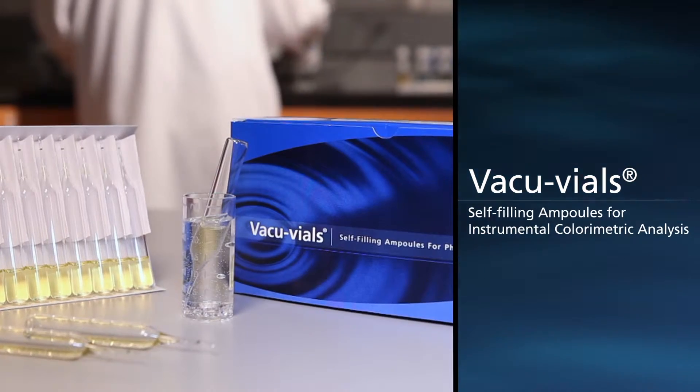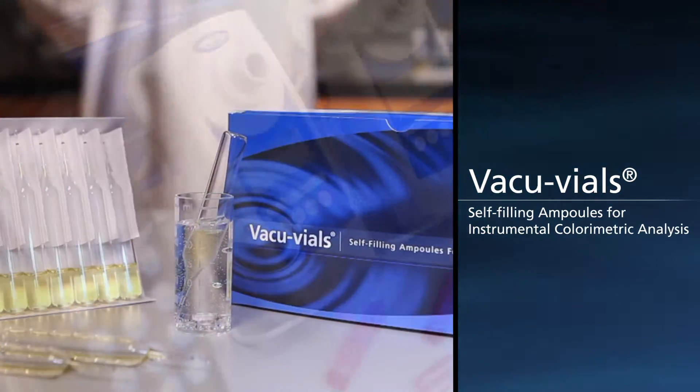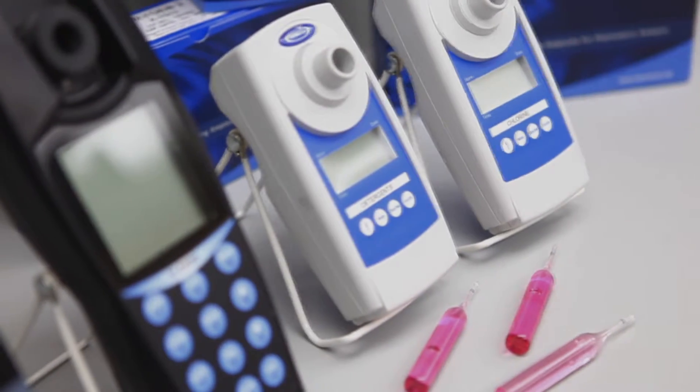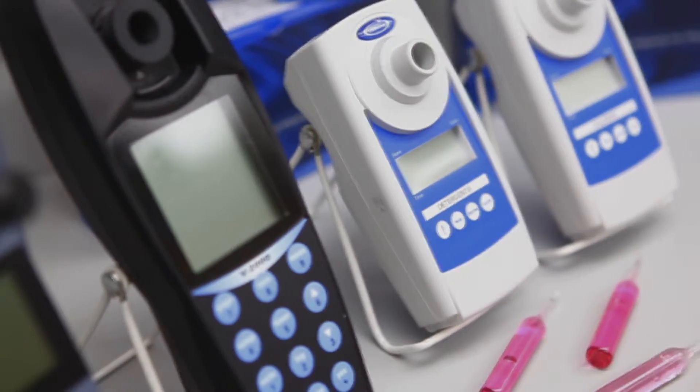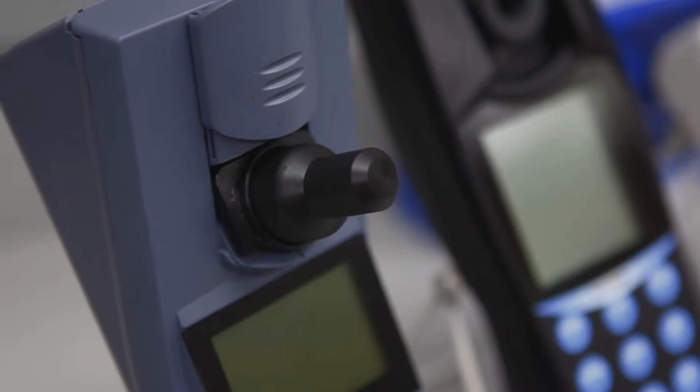Vacuvial Cell Filling Reagent Ampules for Instrumental Colorimetric Water Analysis. Kemetrix unique Snap and Read Vacuvial Cell Filling Ampules can be used with Kemetrix LED Photometers or any spectrophotometer capable of accepting a 13 millimeter diameter round cell.